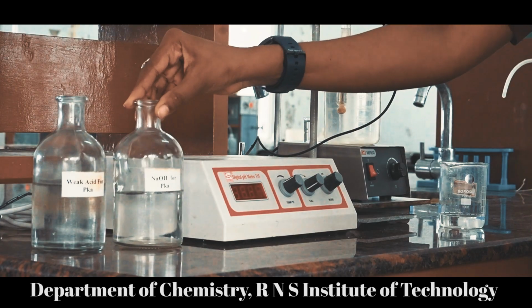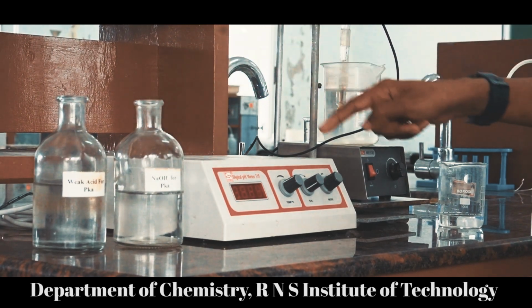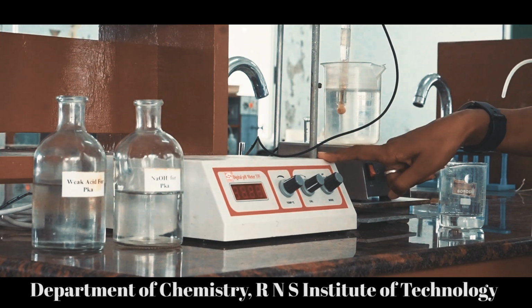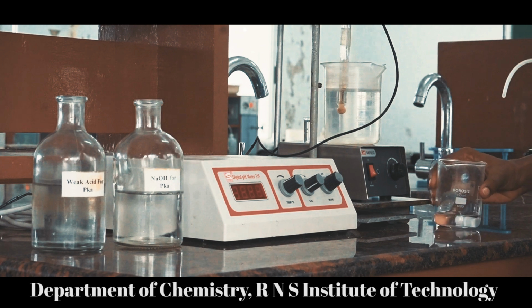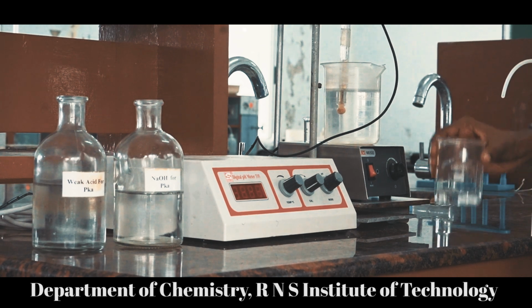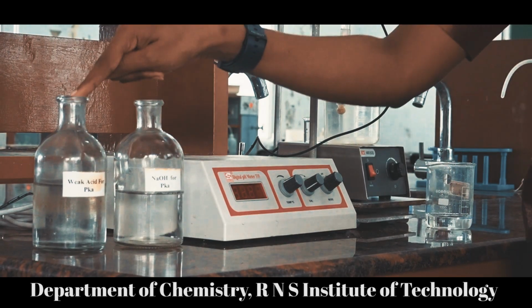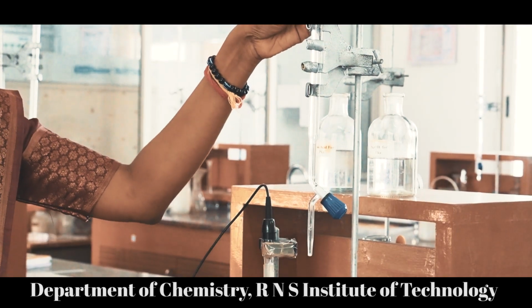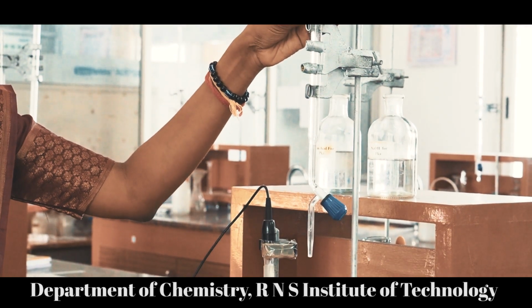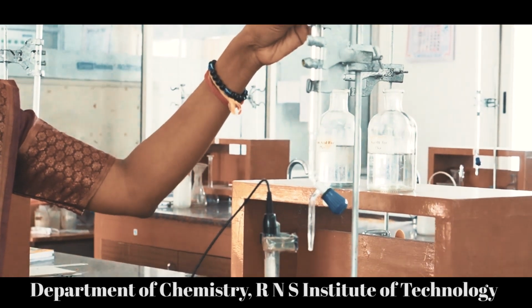There is a digital pH meter, a magnetic stirrer, and a beaker containing a magnetic bead. In this, 25 ml of the weak acid is taken. In the burette, we have used standard NaOH, which means its concentration is known to us.